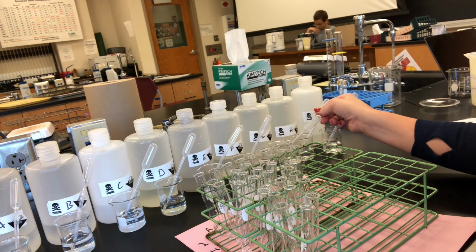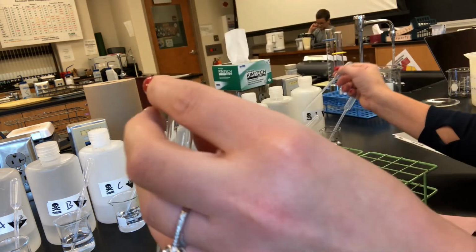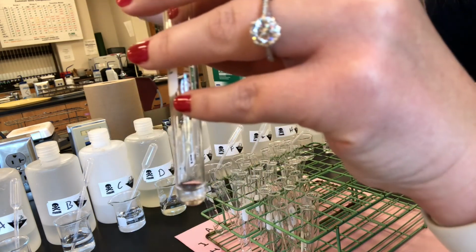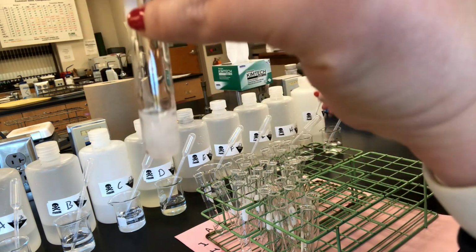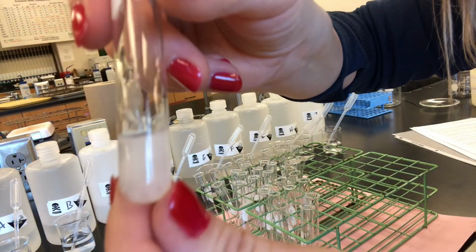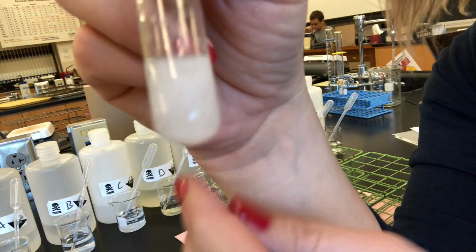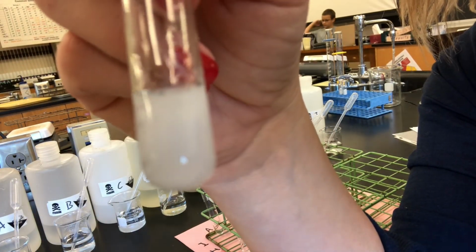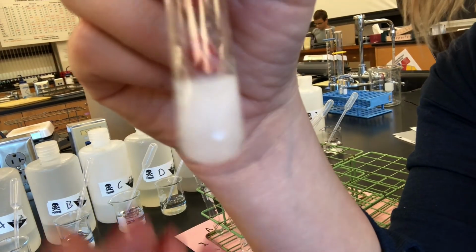Let's go ahead and add about half a milliliter to H. So this is A, and I'm going to add H. Definitely got a precipitate that time, right? We got a white, fluffy precipitate.